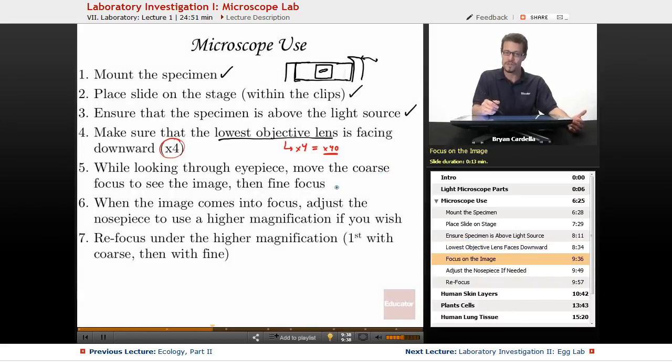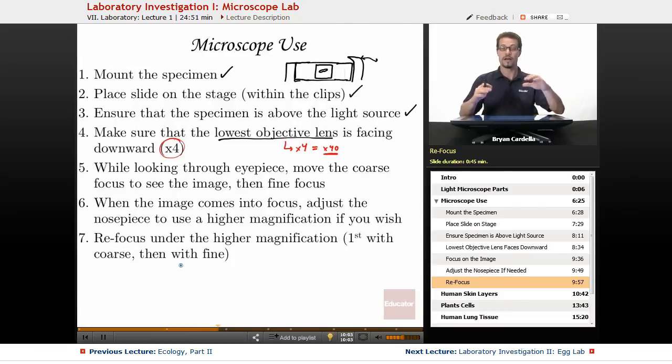While looking through the eyepiece, move the coarse focus to see the image, then the fine focus. Like I told you on the previous slide, you want to start with that coarse focus. That's the one that moves the stage up and down, then when it's nice and crisp, then move the fine. When the image comes into focus, adjust the nose piece to use a higher magnification if you wish. Like I said, you can then move to the times 10, to the times 40 and refocus under that higher magnification. Always go a little bit with the coarse. Once you've actually moved the stage to the right location, usually you don't have to move the coarse focus that much. Just a little bit just to fine tune it and then fine focus, you can move freely back and forth. And it's as if you're looking at very tiny cross sections along the cells. Sometimes if a tissue is a little thicker than one cell, when you move the fine focus, you can see like you'll actually start to see the top of the tissue come into focus and the bottom of the tissue come into focus. It's pretty fascinating how you can zoom into very specific parts of tissues by using the fine focus while you're looking through.